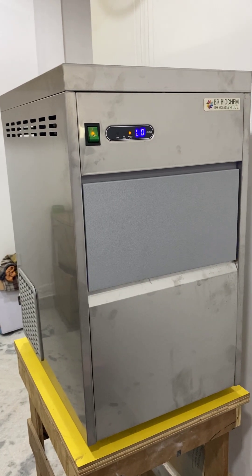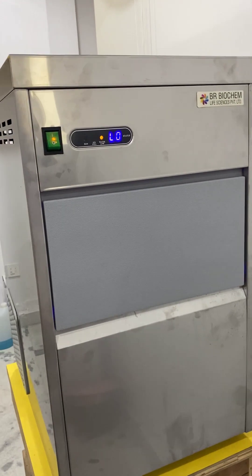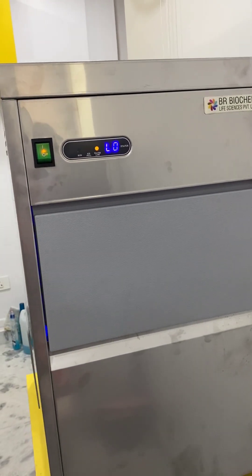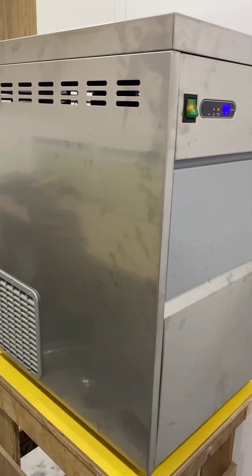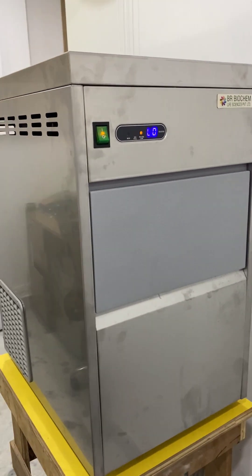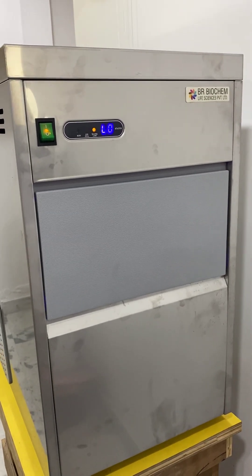Hello everyone, welcome to BR Biochem Life Sciences Private Limited. This is our ice flaking machine having 50 kg per day production capacity. We have different capacities also, like 20 kg, 50 kg, 70 kg, 100 kg, 120 kg, 150 kg, and so on.